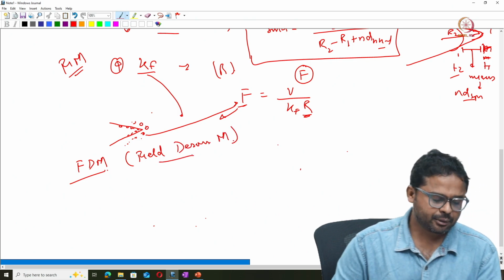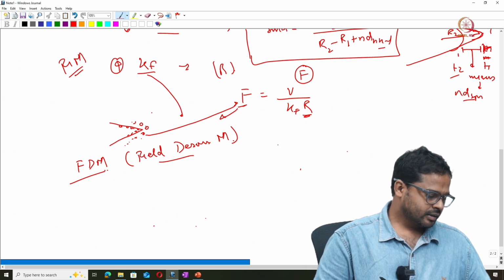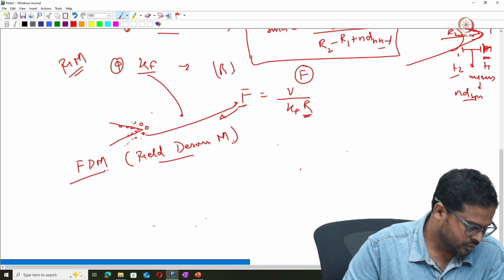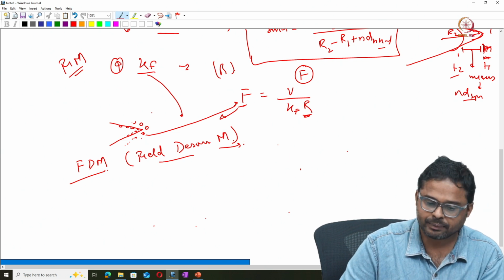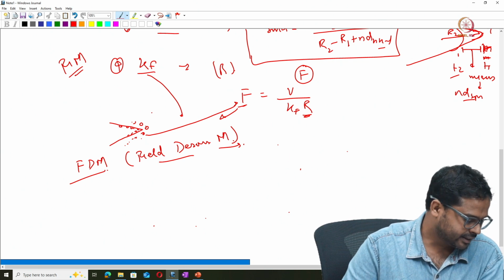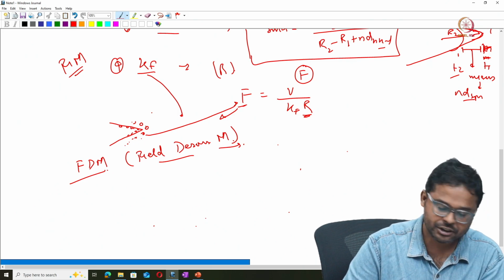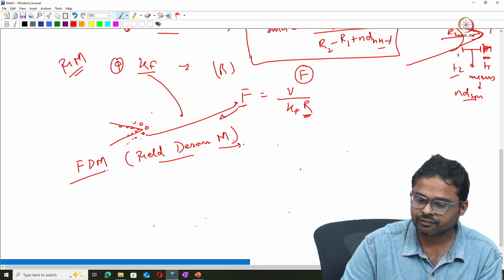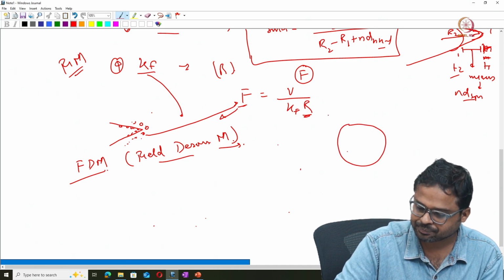This is nothing but atom probe tomography. It's an estimation that can be done for these parameters also. Okay, so the desorption image, which is formed by the arrival positions, also reveals the crystallographic information used in the atom probe, which is similar to the FIM. So they also have a desorption image.